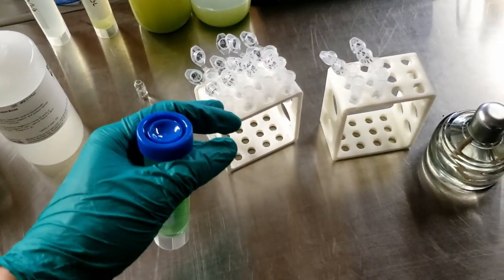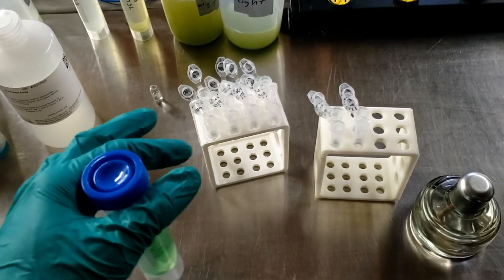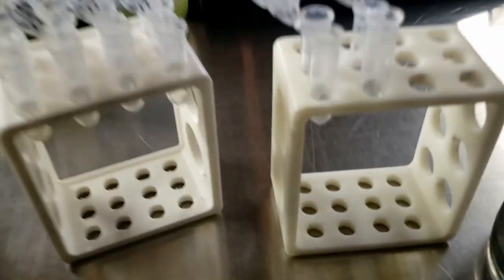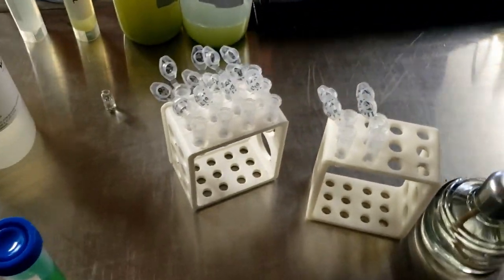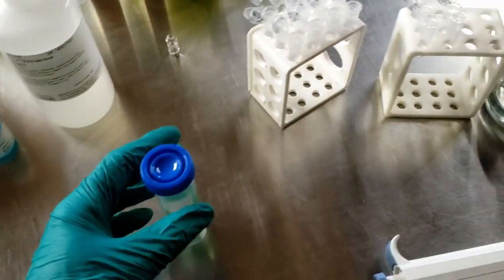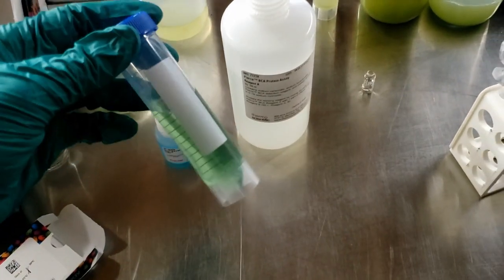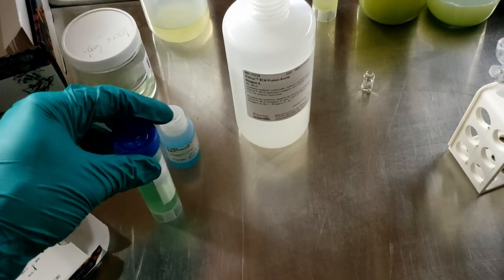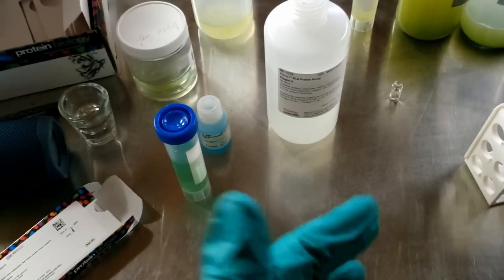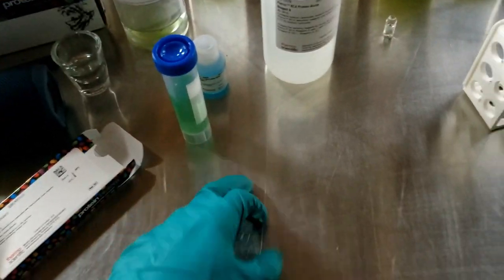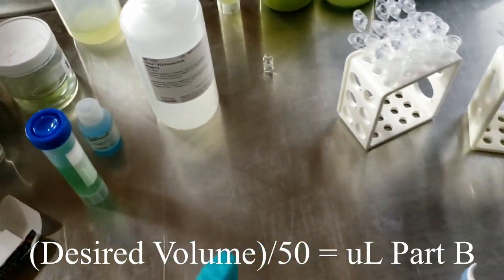I think it's really convenient to have these 2 milliliter centrifuge tubes. Most microcentrifuge tubes are only 1.5 milliliters, so these have that deep bottom. You can also do it in test tubes if you want. You don't have to do 50 milliliters of this and 1 milliliter of this. I needed 32 milliliters, so I did 32 milliliters of this and 640 microliters of this. You can just set up a little fraction ratio and solve for X if you need to use a smaller volume.